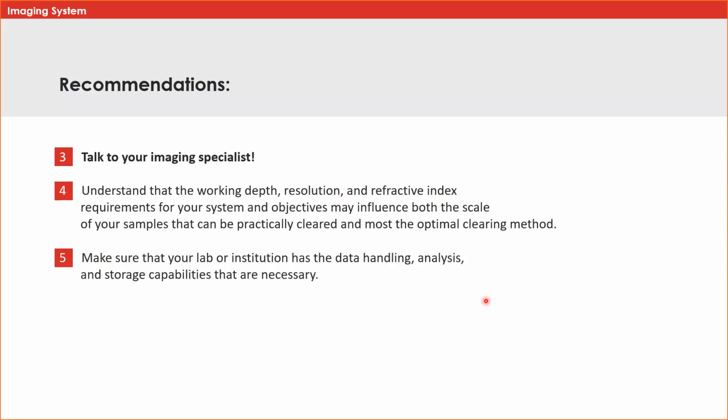The third is to make sure that your lab or institution has the necessary data handling and analysis capabilities to handle these data sets. These are extremely large data sets, from high triple-digit megabyte sizes to low double-digit terabyte sizes. And so the data handling, transmission, and analysis requirements are not trivial, but for our purposes, they don't really touch on what sort of tissue clearing strategy we have. So just be sure that this is one of the things that you do want to find out about, if you can actually handle and analyze the data.